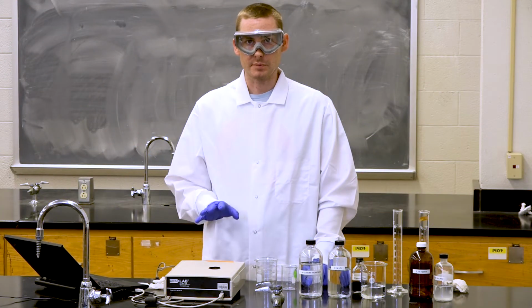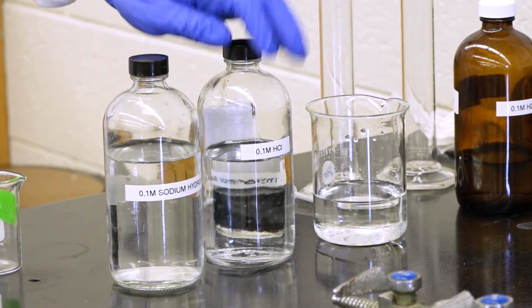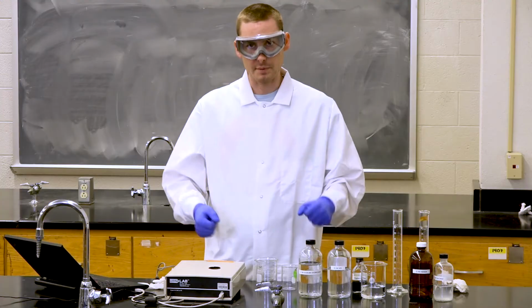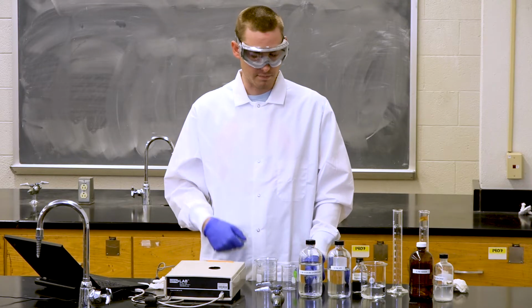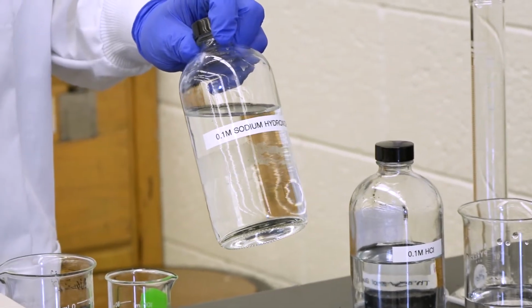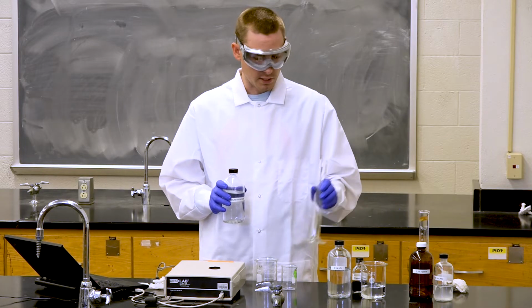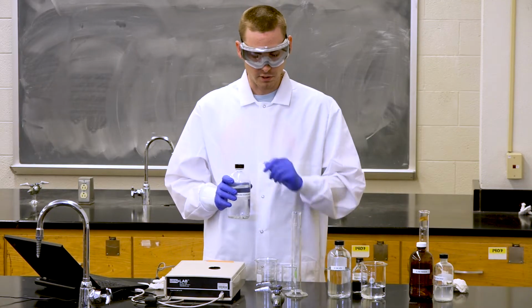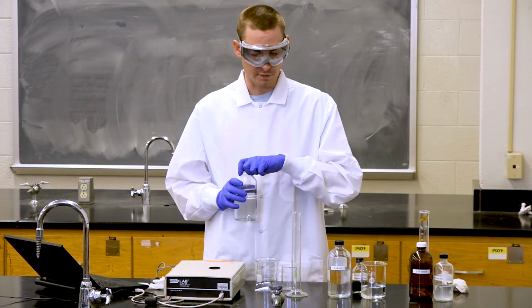So for the next part of the experiment, we're going to be measuring some ionic solutions, a strong base and a strong acid, and then we're going to be mixing them together and measuring their conductance after we mix them. So to begin, we're going to be using 0.1 molar sodium hydroxide, but we're going to want to dilute this 10 times into 0.01 molar sodium hydroxide. We don't need it nearly this concentrated in order to get these conductivity readings.